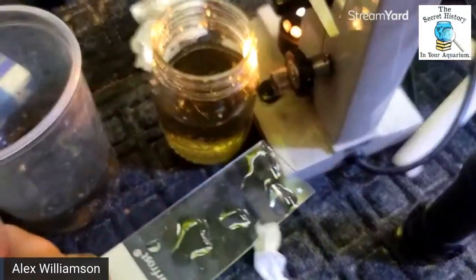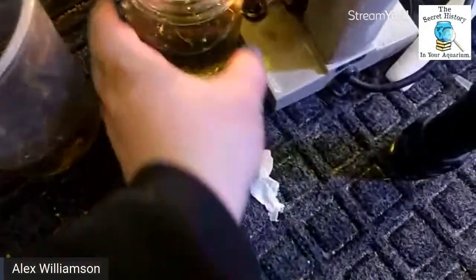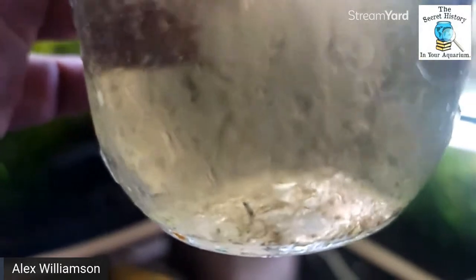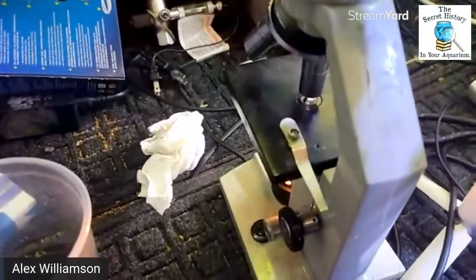We're down to the level, because that's boring. I mean, I could show you guys a baby shrimp or something. It looks like a monster on here. I could show you guys that. But what we did was we took a sample from here, which was the outside sample. And in here was some mulm and some junk. And there are daphnia that we could definitely look at in here. So we can look at those. Those are in the next size up.